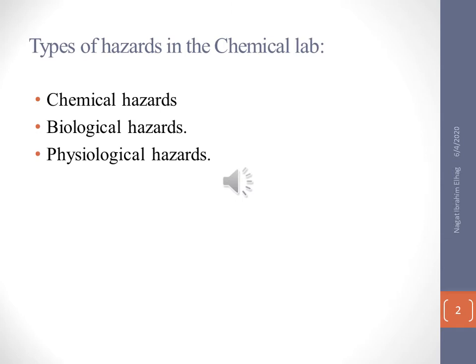There are many types of hazards in your chemical lab. One of them is chemical hazards, also biological hazards, and physiological hazards. On the following slides, we will discuss biological hazards, and after that, physiological hazards, and our main topic will be chemical hazards.